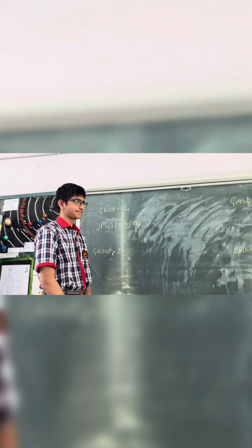What type of reaction is it? It is a combination reaction. Combination reaction. Okay. Why is it a combination reaction? Because in this, two reactants combine to form a product.